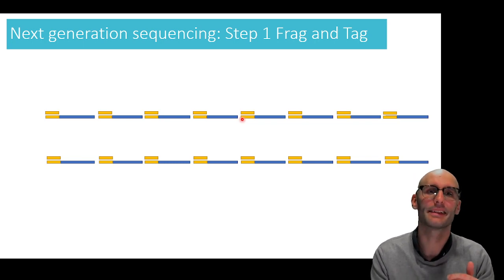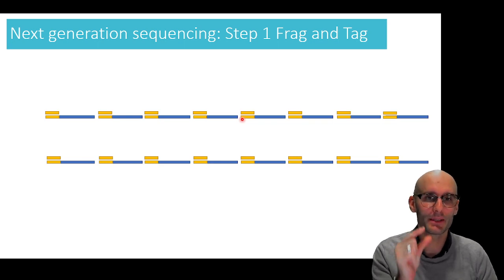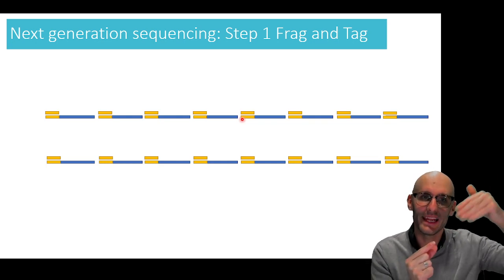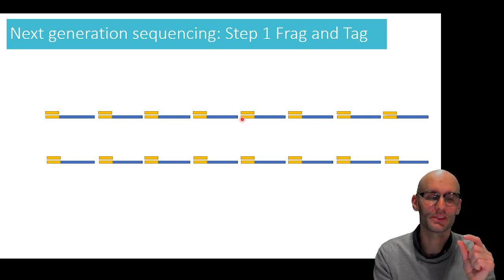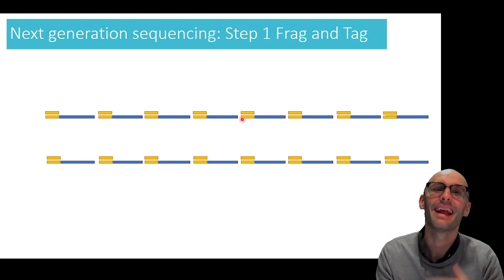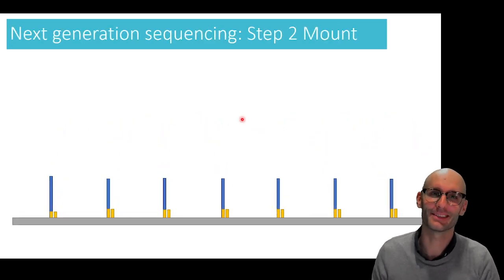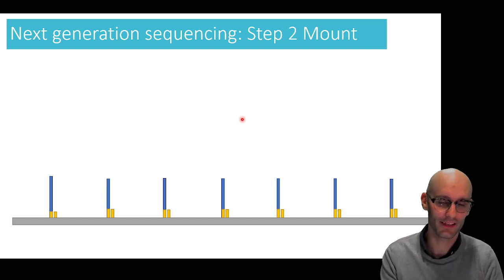Now these are actually going to act as a primer, and if you don't know what a primer is, make sure you watch my PCR video. But it's a double-stranded bit of DNA on which we can now extend and elongate. We can attach nucleotides to the end of that double-stranded DNA and build up our sequence. So now we've got these little bits of double-stranded DNA attached to our single-strand DNA, and so we've fragmented it and tagged it with our little barcodes. What we do next is we then attach it to a surface. This can sometimes be a bead, but it's often actually just a glass slide. So we attach it to a glass slide, just like this.